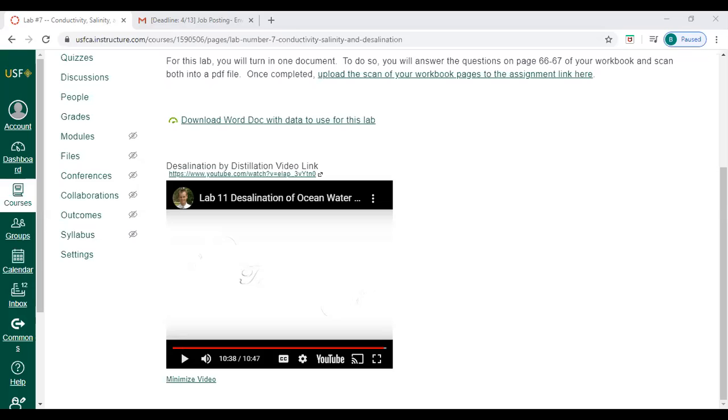The units for conductivity are usually in Siemens. The readings that they got out were in microsiemens. We would have used either millisiemens or microsiemens. You'll see it called out on the data sheet that you download which unit it's in. And then you measure conductivity because you can't technically measure salinity.